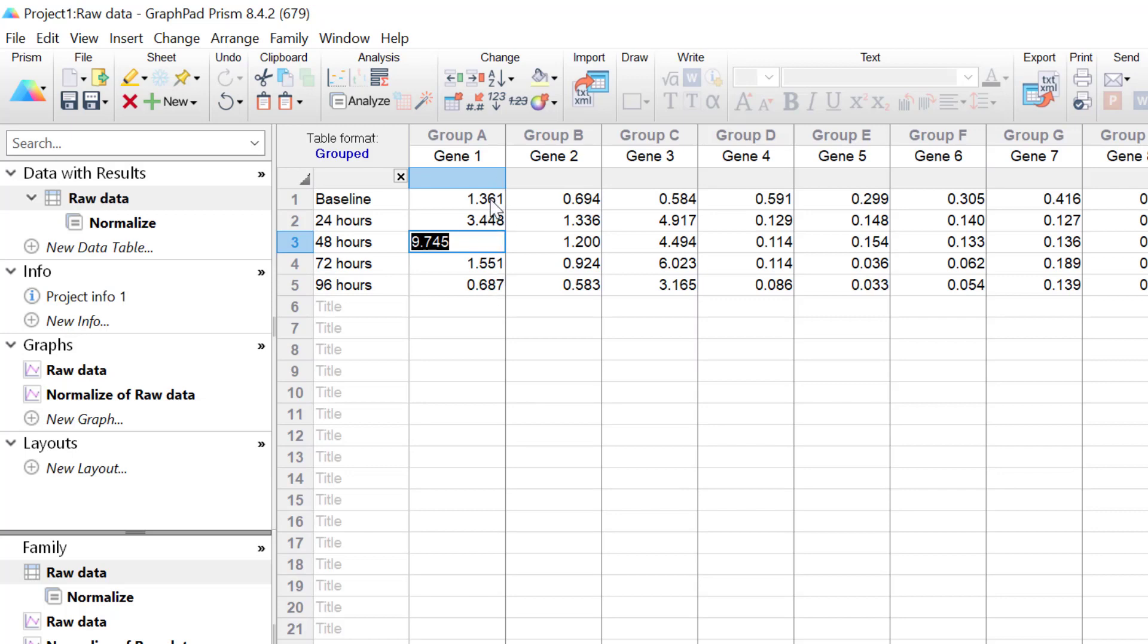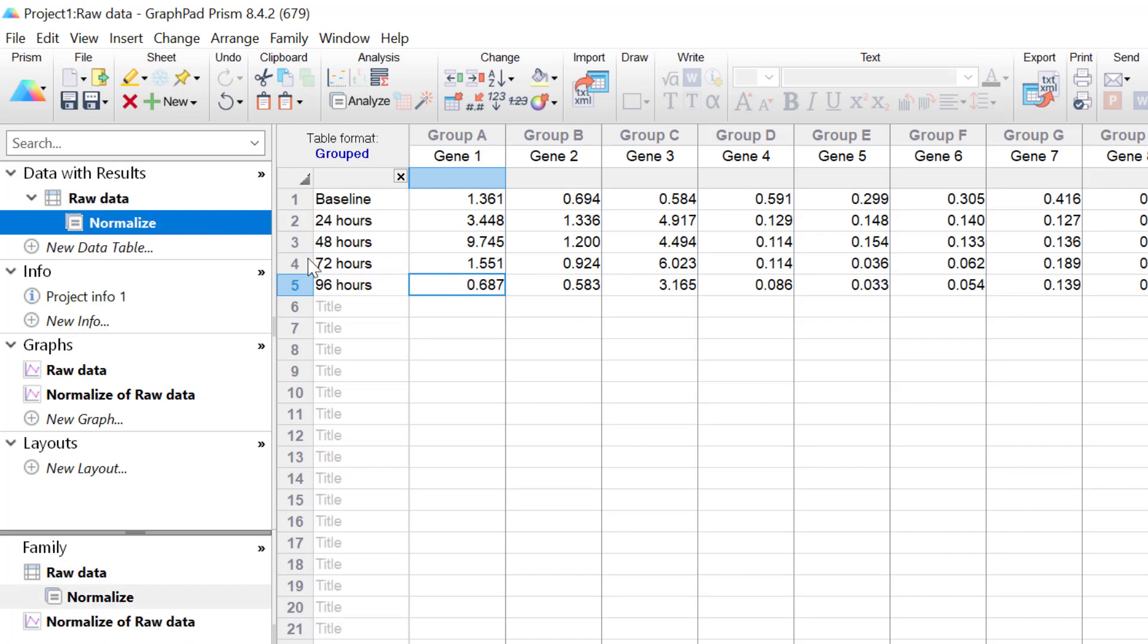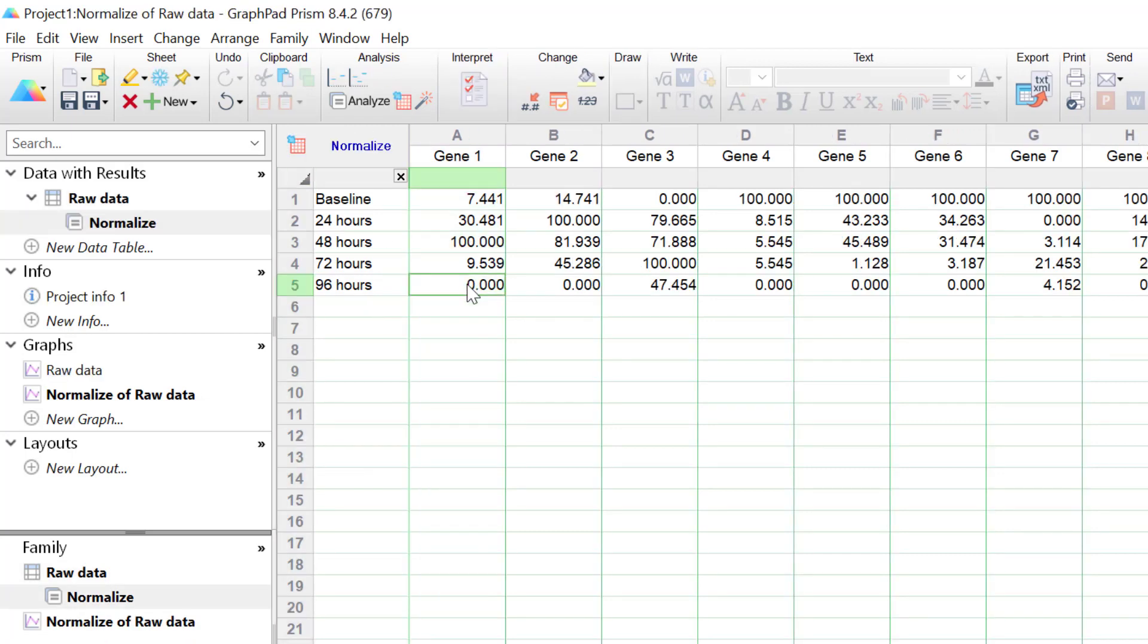So it is set as 100%. Similarly, the value for 96 hours was set at 0%, and that's because if you look here, this value is actually the smallest value within this column, as you can see here.